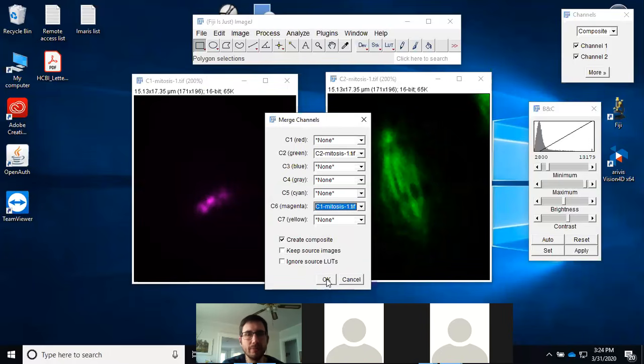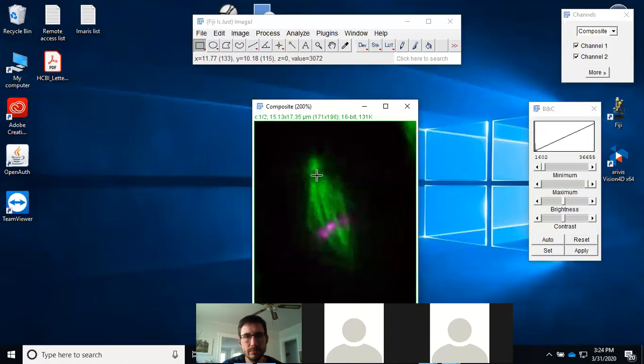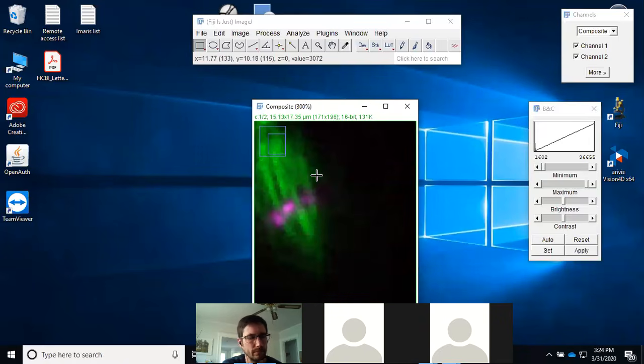Yeah, it's basically the opposite. The Gaussian blur is actually going to blur your image out more, whereas the median is giving you a little more sharper image. I see. There is one important distinction between Gaussian and median: the median value is actually a measured value. It will not compute a different value.